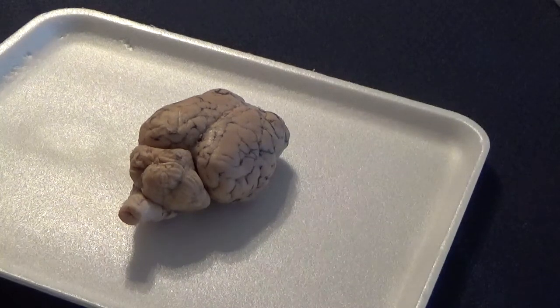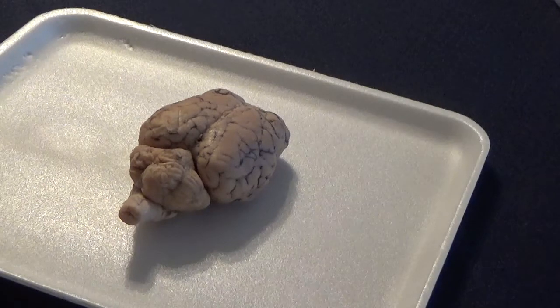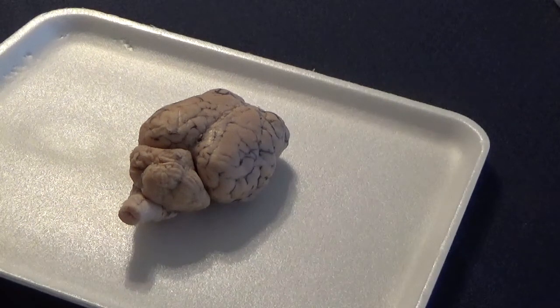All right, so welcome to our study this morning of the sheep brain. We're looking at a sheep brain because the sheep brain is very similar to a human brain, and understanding mental health means understanding how our brains work. So by dissecting a sheep brain, we can get a better understanding of how our brains work, and that relates to how our emotions and perception and senses and everything else that's part of our reality works.